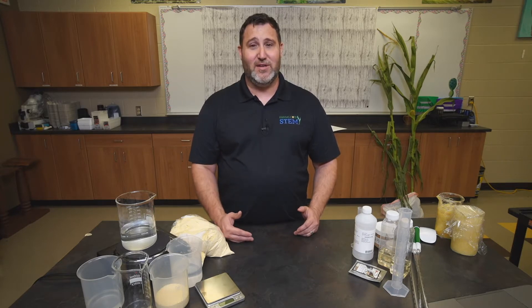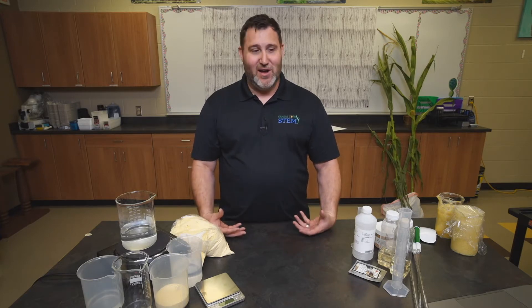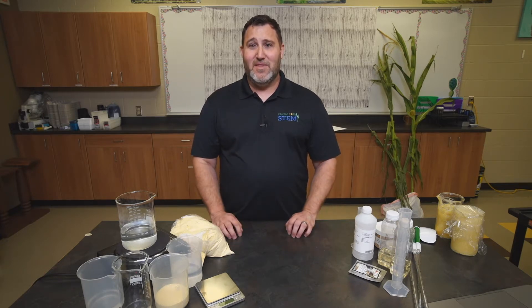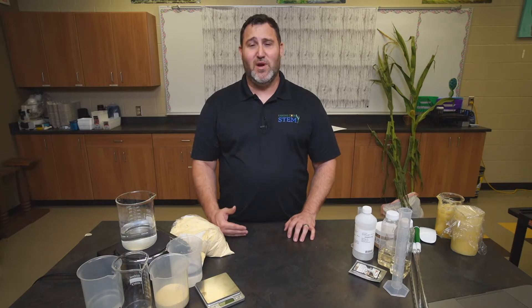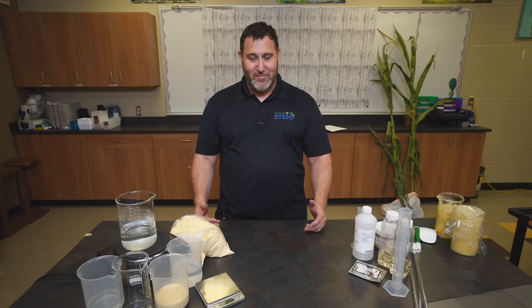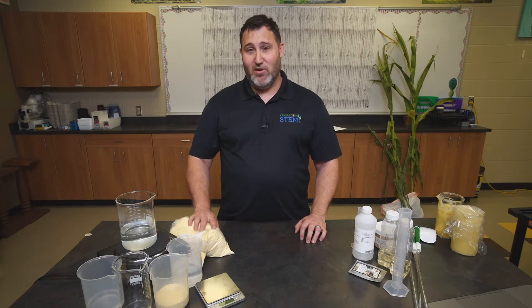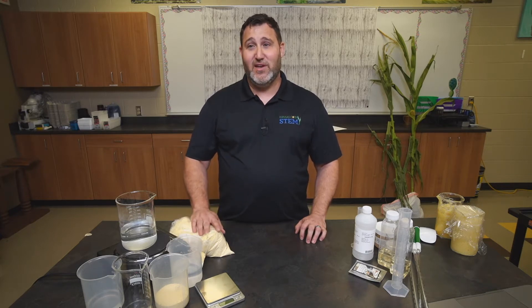The students really feel like they're doing some really relevant science to their lives. It allows them to use some lab equipment they're not always used to and familiar with. But one of the main reasons I love it is because the environmental topics are so relevant today and so important to this generation of students. They're really engaged and very interested. We're going to start with our corn grind and by the end of this video we'll take this all the way to the end product — some ethanol which we can actually burn and be used as a biofuel.